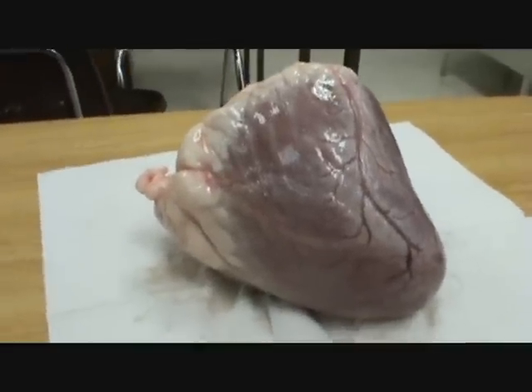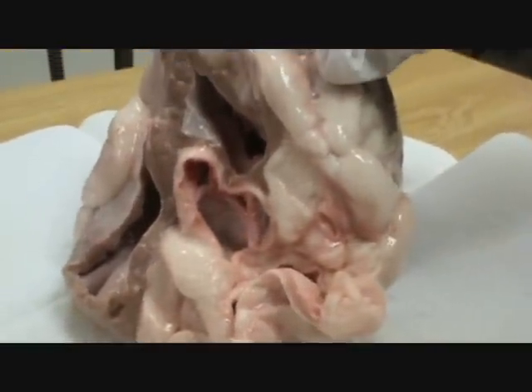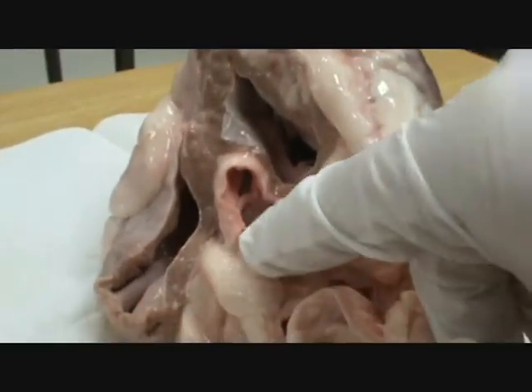Mmm, looks yummy, doesn't it? If I were to take a guess, I'd say that's the aorta.